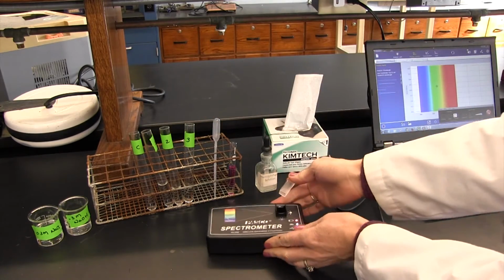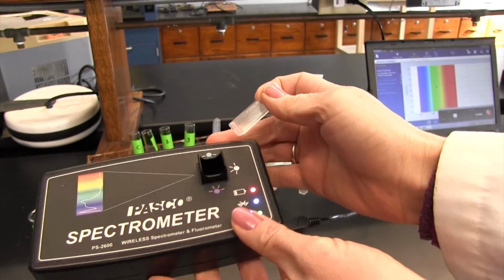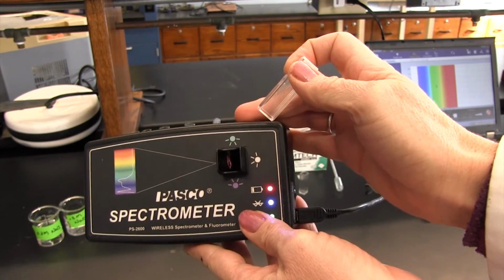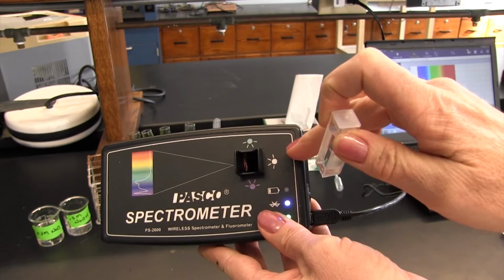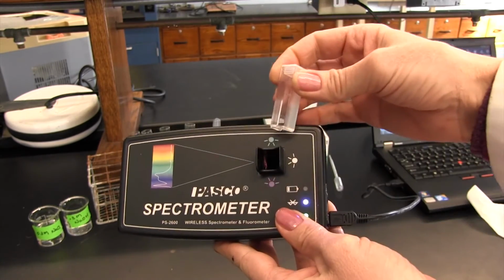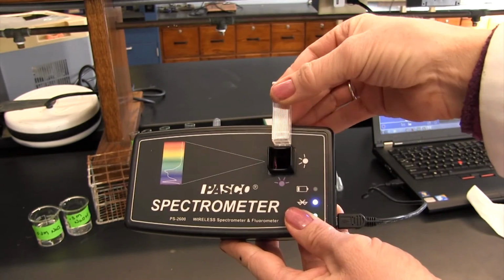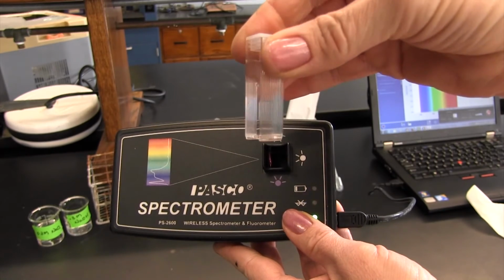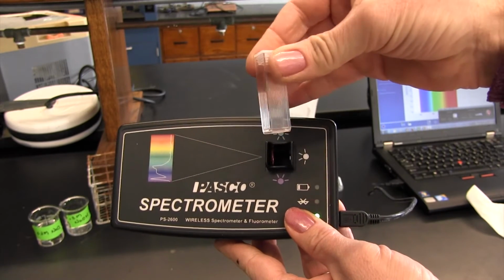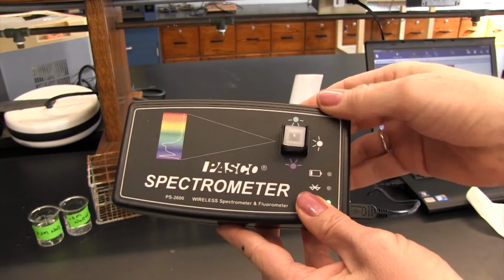And if you look inside the spectrometer, you can see right there on the left wall, there's a light beam that passes through the spectrometer from here to here. So when you insert the cuvette, you want to insert it so that the clear sides are what the light beam is passing through. Right now you're looking at the line side. So I'm going to insert my cuvette like that.